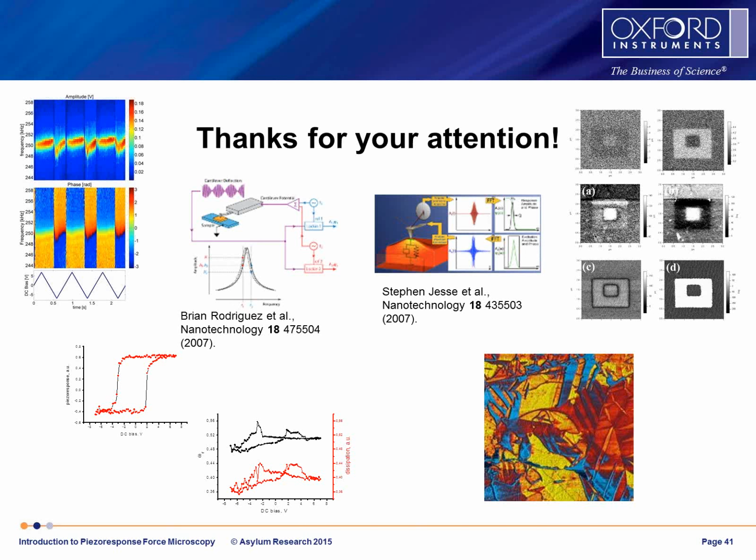I guess so. The other part of it is that sample cleanliness is actually very important. The surface that you're scanning, this is a nanomechanical measurement, and so your tip-sample contact can play a very strong role in the response. We see this all the time with ferroelectric materials. They tend to have charged surfaces, which tend to collect contaminants and other things from the surface, and so sometimes you have to scan away at them for a while to scrape off that stuff to get to the actual ferroelectric surface.